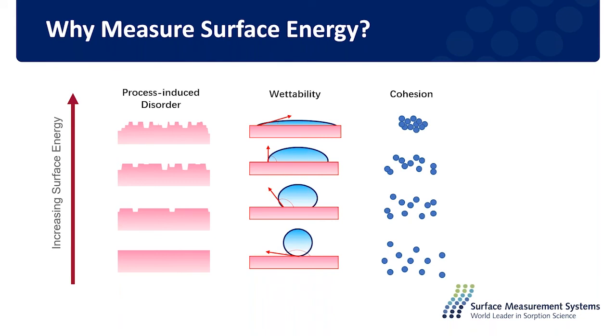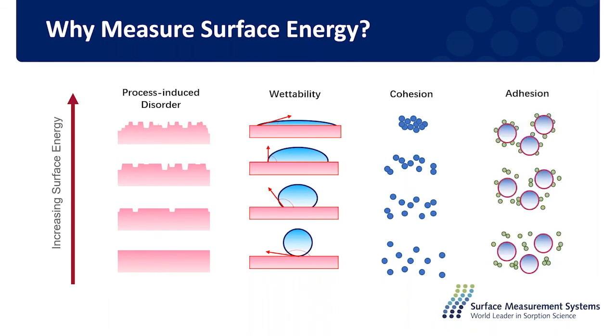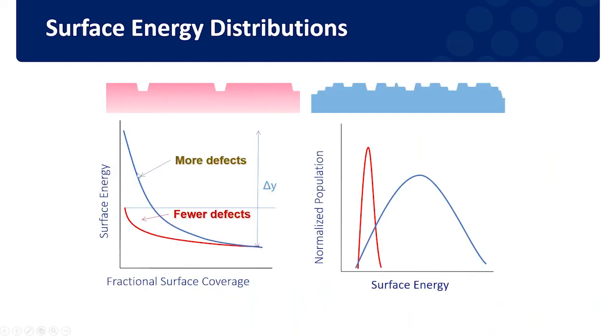So this is useful for predicting the likelihood of a sample to aggregate or clump together. And then we can go a step further to see how a sample's likelihood to adhere to samples of different compositions. So it's likelihood to clump or aggregate, but now in a mixture.